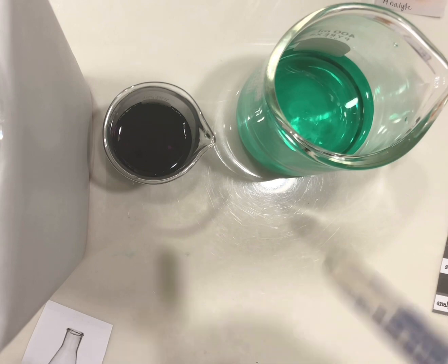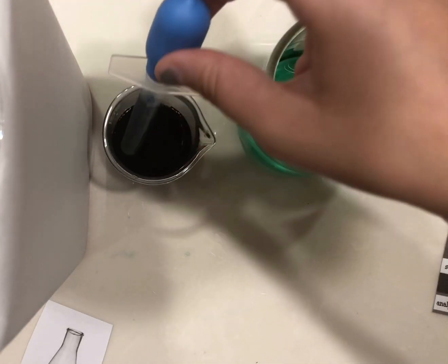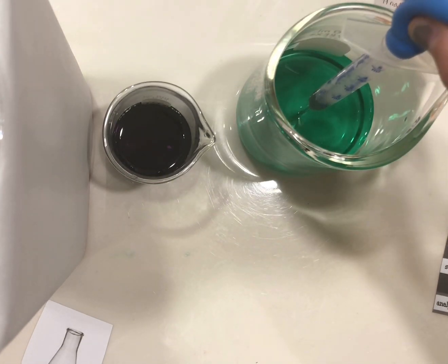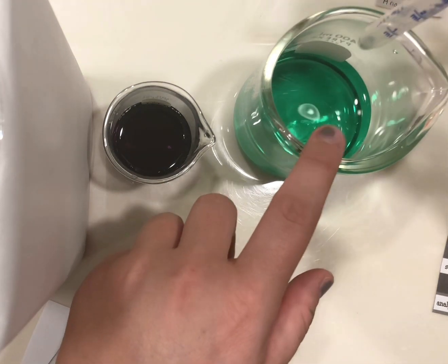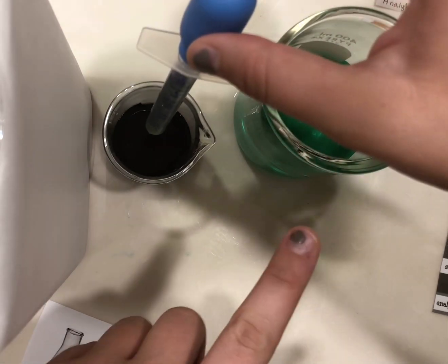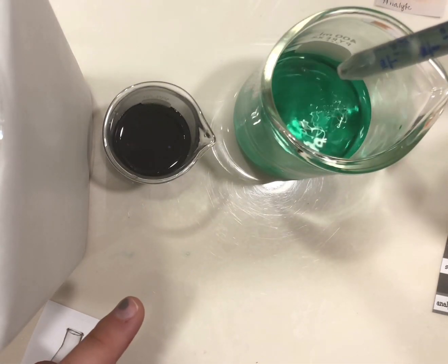We are going to go from the titrant, which is this purplish color, and add it into our analyte. Now, for this, we don't want to do the straight drop. We want to go 1, 2, 3, 4.